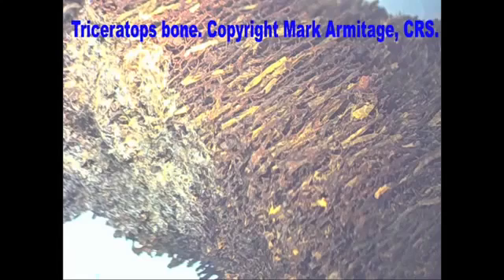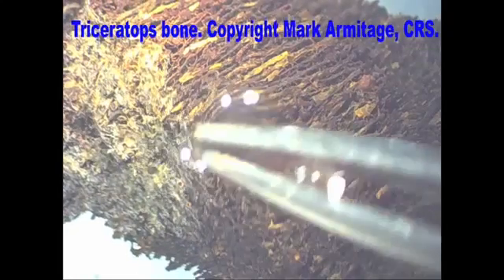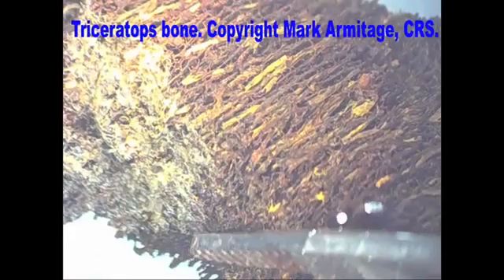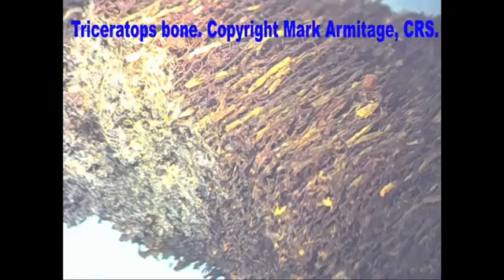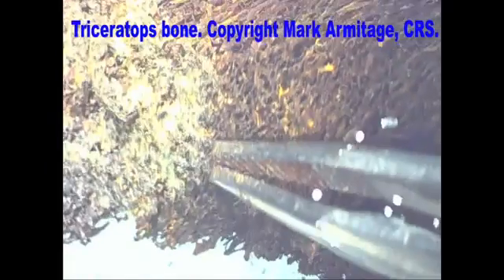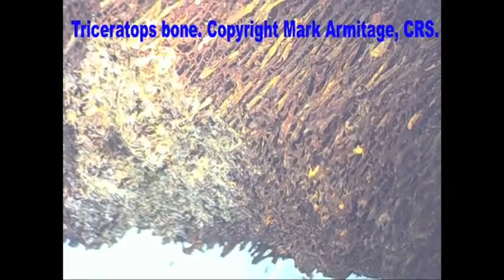Here is a piece of triceratops bone that has been decalcified, so all the bone minerals have been removed. You can see how many blood vessels are here. This white area is soft tissue on top of these blood vessels. The bone is very stiff because it's fossilized, and yet there's soft tissue in here — this is about 40 power under the dissecting microscope. As I move this, you can see these soft tissues waving back and forth in the liquid. This is impossible if these bones are that old — this would all be gone. Here you see the matrix of blood vessels, all permineralized and hard as rock, yet the white areas show all the soft tissue still present after decalcification. This is an indication that these bones are very young — not even 20,000 years old, probably much younger than that.